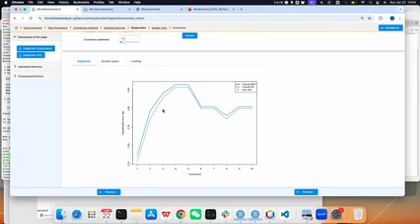In our result, we use the first 3 components, but the second and the third components still get a relatively high error. But the first one has a very low error, which means the component is more reliable.